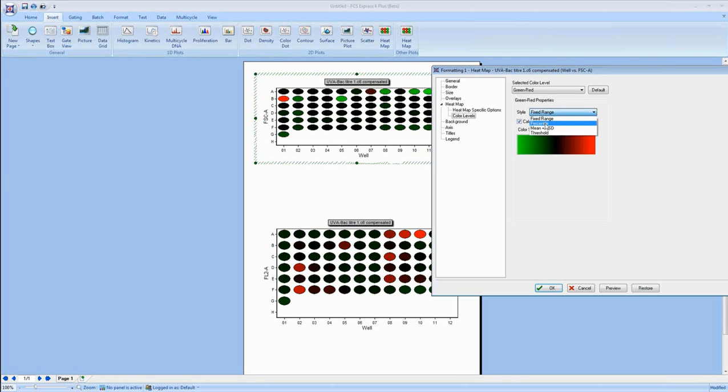But again, we can look at a very similar thing with percentile-based data, or percentile levels. You can use percentile levels instead of a fixed range or a standard deviation, and again, that value can be calculated based on the data, or it can be calculated automatically or manually by anything you want to insert here. You can see that we have certain percentiles being presented here in the coloring scale, and again, you can come in here and change these at any time you'd like.